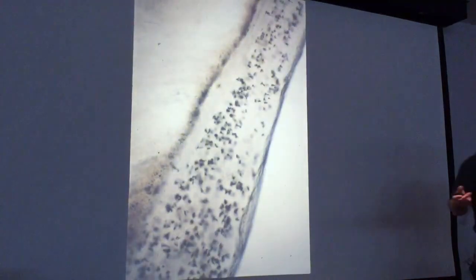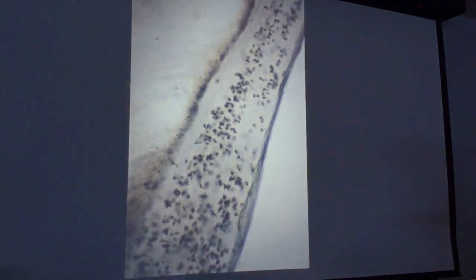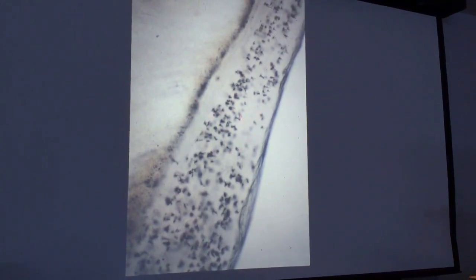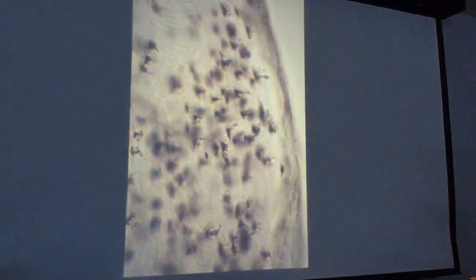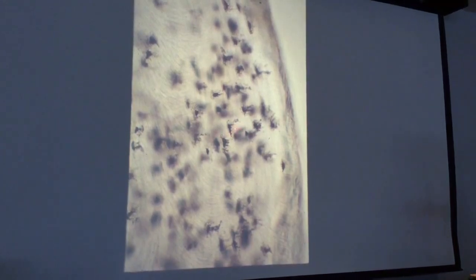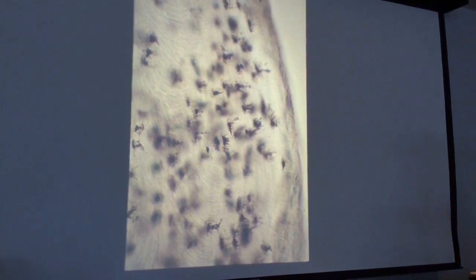Now on the lab practical, the magnification wouldn't be quite that great, so it'd be a little bit easier to determine. And what tissue do we have right here? Cellular cementum. Right. And what are these things right here? Those are lacunae. Okay, you can't really see the cementocytes in a ground section. And how about those little thin fiber-like structures? Canaliculi.